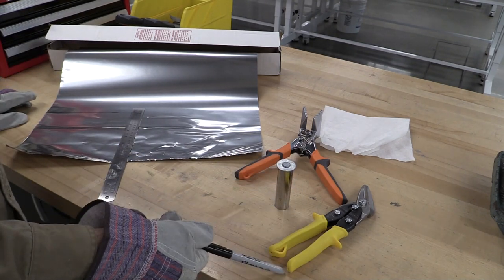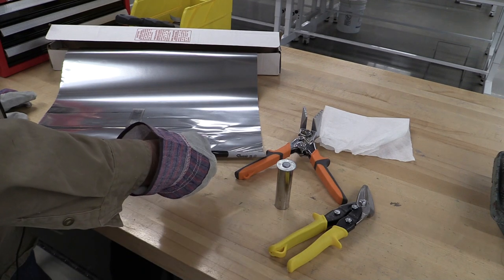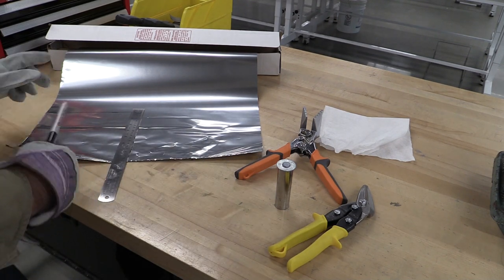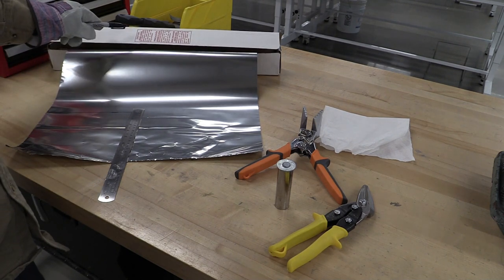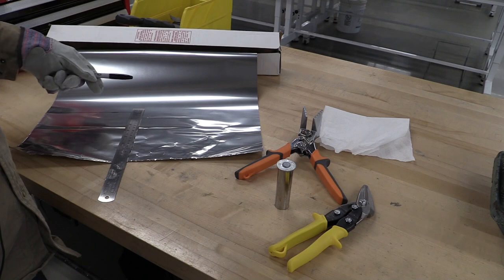The things we have here are a pair of tin snips, a set of folders and crimpers, a ruler, a sharpie, and we're working with 321 stainless steel foil wrap that's two thousandths thick.